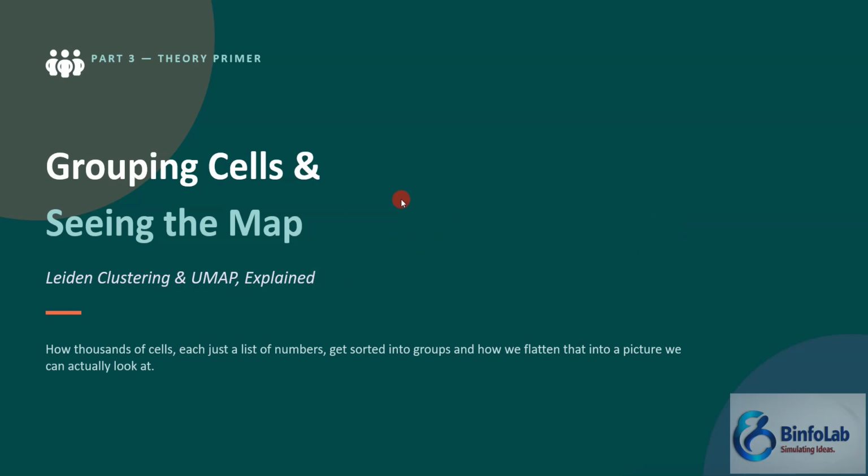I named this slide "Grouping cells and seeing the map: Leiden clustering and UMAP explained." You may have a question in your mind: how do thousands of cells, each just a list of numbers, get sorted into groups, and how do we flatten that into a picture we can actually look at?